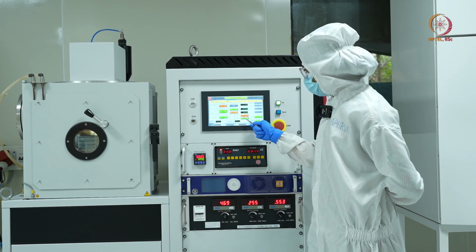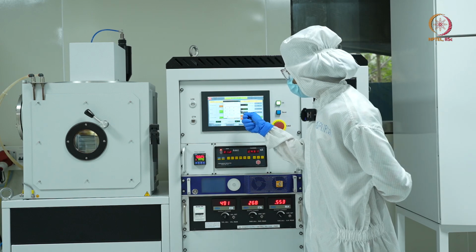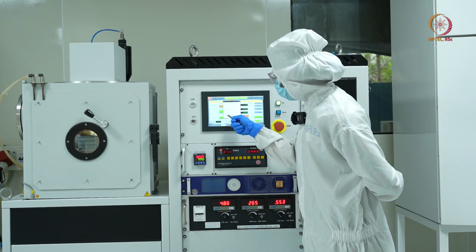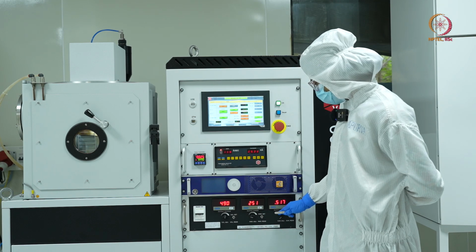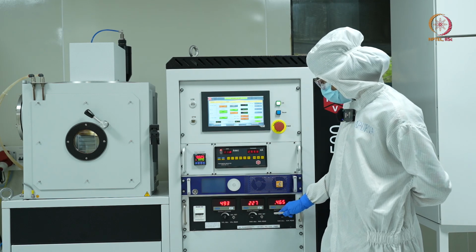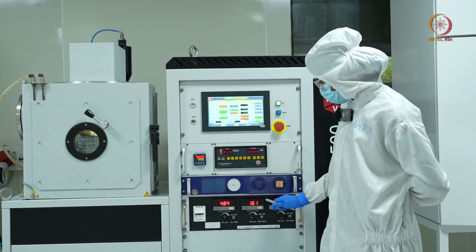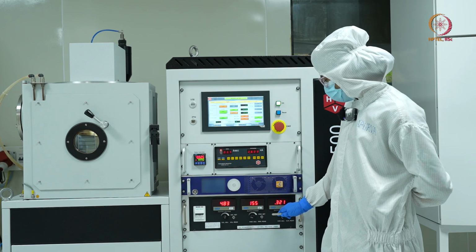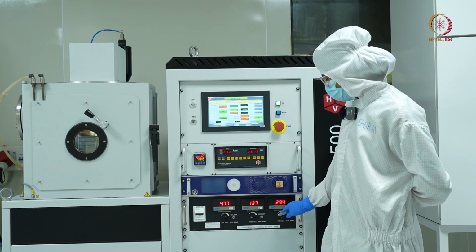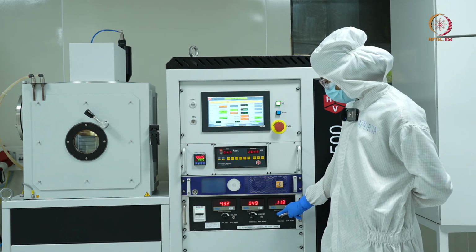To stop the deposition, first I'll close my shutter, I'll decrease my argon flow to 10, I'll decrease my current slowly to 0. You can see now the power is decreasing. That means we are not supplying sufficient power for the argon atoms to get ionized.